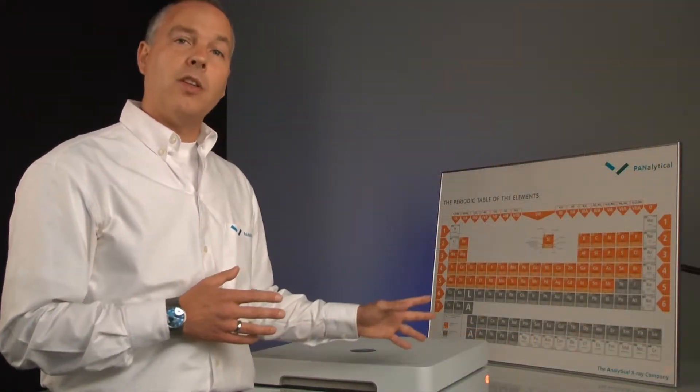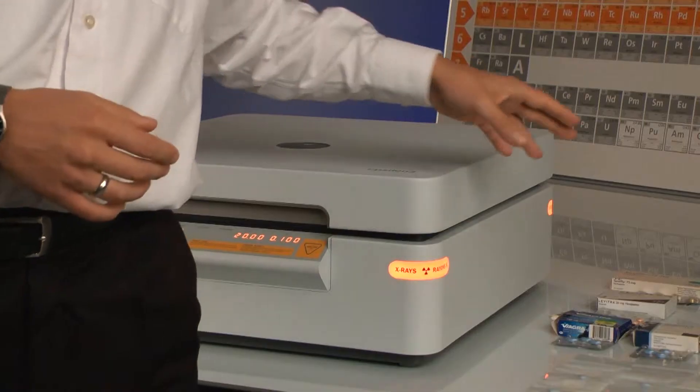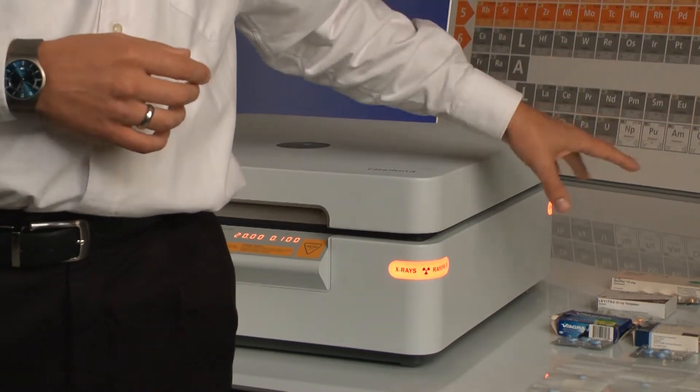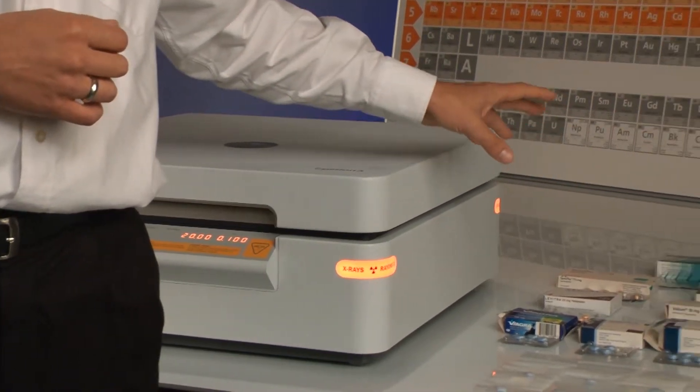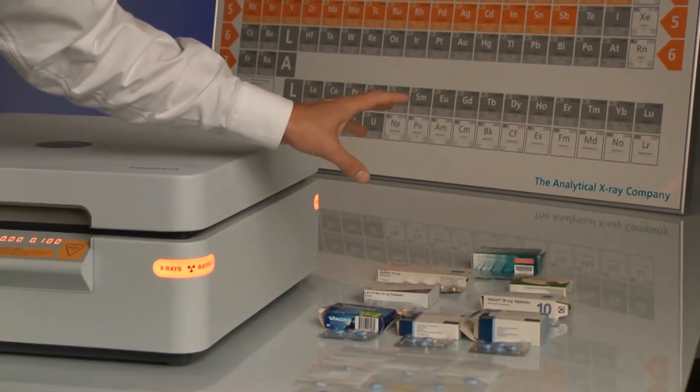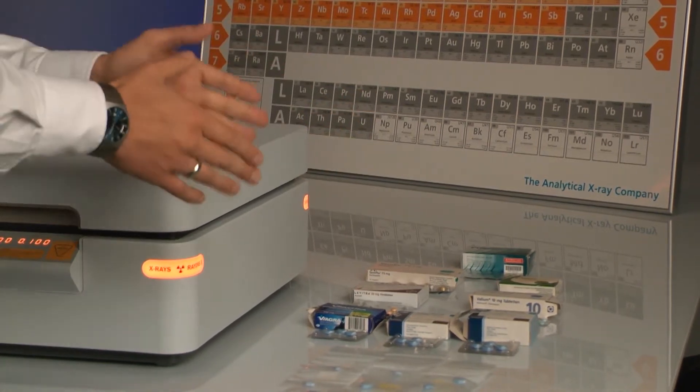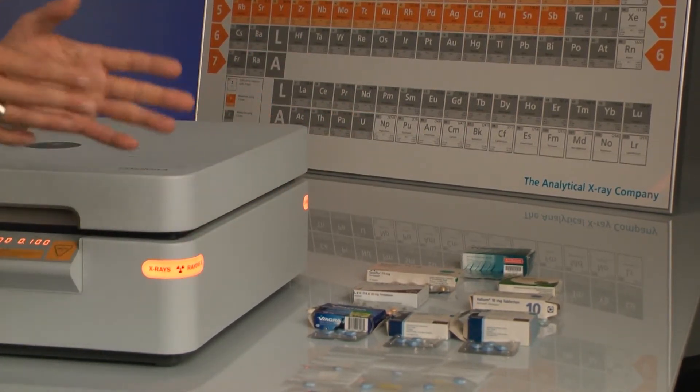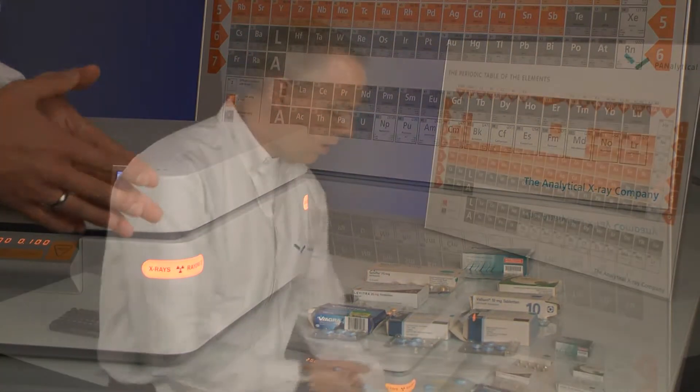Before we begin, let's have a look at the samples we're going to measure today. Here we see an array of pharmaceutical tablets. These are lifestyle drugs which are commonly counterfeited, and we also have a series of fakes that have been provided to us by government authorities.